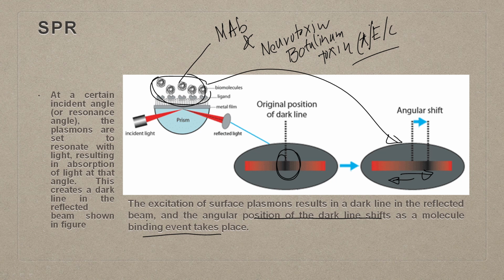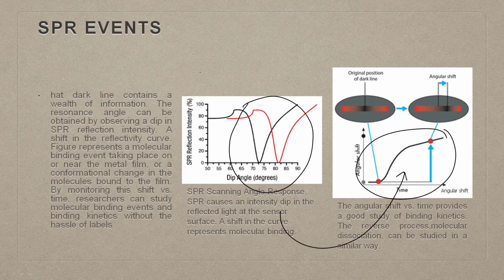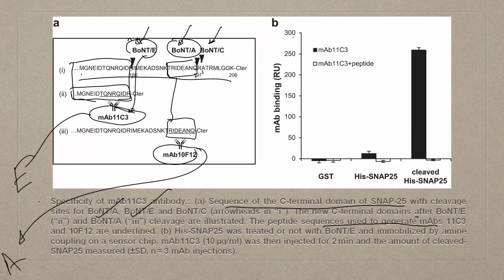Okay. So, this interaction is being captured on a SPR chip, and as I mentioned, in SPR these are label free. There is no labeling, because you are only evaluating or quantifying the interaction. Okay. So, now coming back, you have the monoclonal antibody 11C3A, which is against E, and this is the peptide interaction.